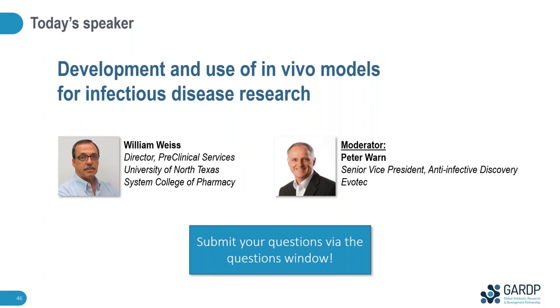The next question is, are there any benefits of doing an immunocompetent model over an immunosuppressed or immunocompromised model for lung infections? Well, in some cases you have no choice. We have tried on numerous occasions to get things like MRSA or Acinetobacter to work very well in an immunocompetent animal. We could not. You can use certain mucoid strains of Klebsiella and Pseudomonas that will grow equally well in competent versus neutropenic animals. Your dose required for efficacy would probably be a little bit different: lower required dose in immunocompetent animals if it grows, slightly higher dose needed in immunocompromised. I don't know if there's any particular advantage of doing one or the other. It may just come out of the necessity for the model itself.